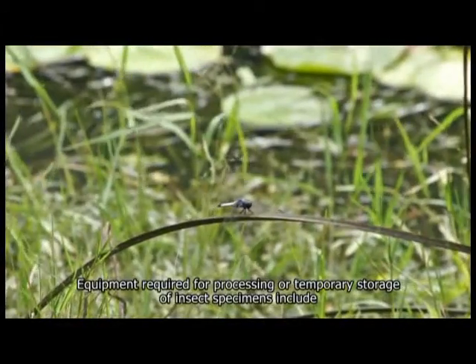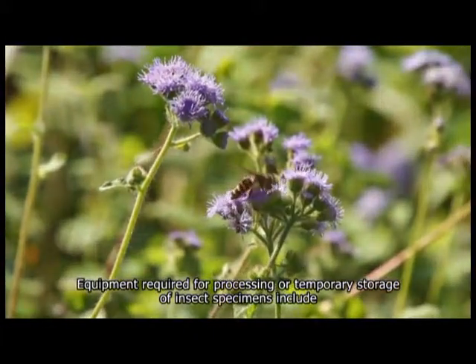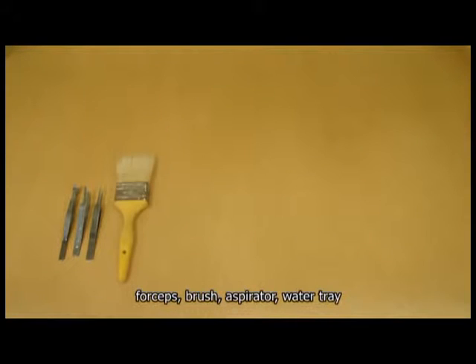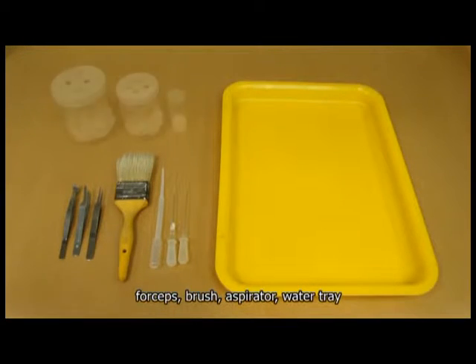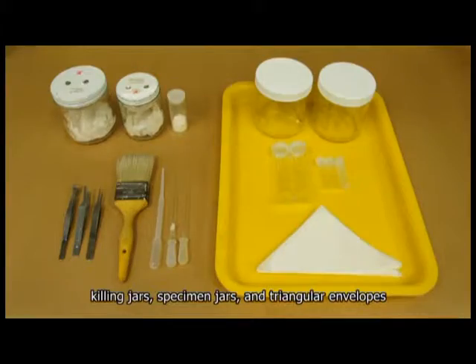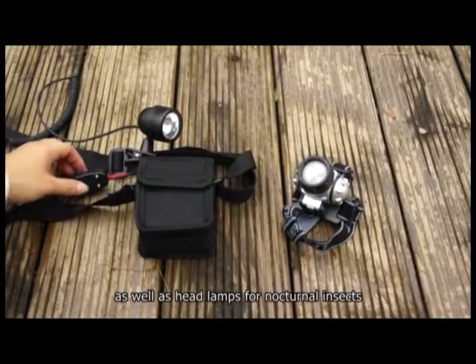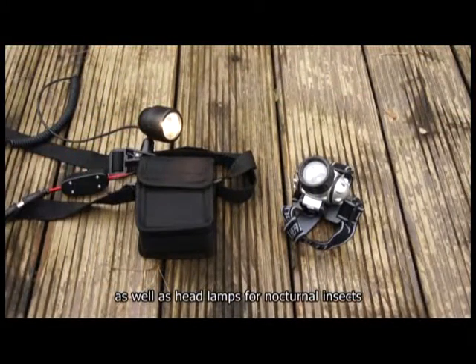Equipment required for processing or temporary storage of insect specimens includes forceps, brush, aspirator, water tray, killing jars, specimen jars, and triangular envelopes, as well as waders or water boots for aquatic insects and headlamps for nocturnal insects.